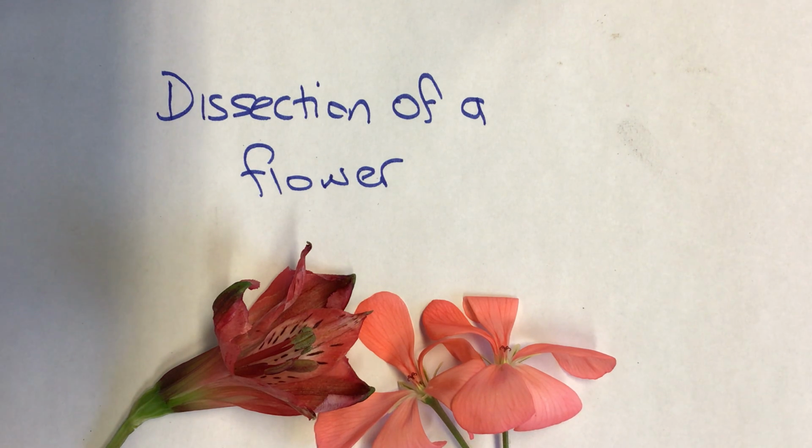Dissection of a flower. This corresponds to pages 20, 21 and 22 of your booklet. So the flower is the reproductive organ of the plant. It contains the male and female sex organs. The male sex organ is called the stamen, S-T-A-M-E-N, and the female organ is called the carpel, C-A-R-P-E-L.